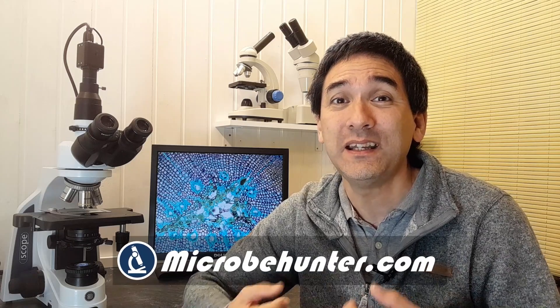Hi, hello and welcome. Microbe Hunter here, Oliver here. Today in this video I would like to show you how I connected an industrial HDMI camera to a microscope — not only to a compound microscope like I have over here, but also to a stereo microscope. At the end of the video I would like to talk a little bit about the advantages and disadvantages of using such a camera system.